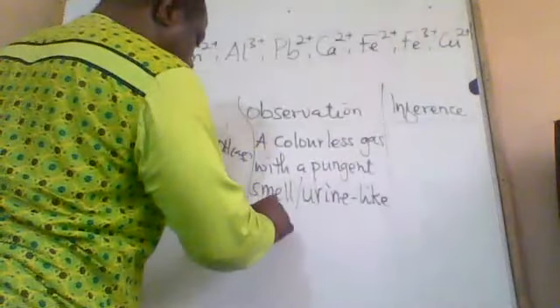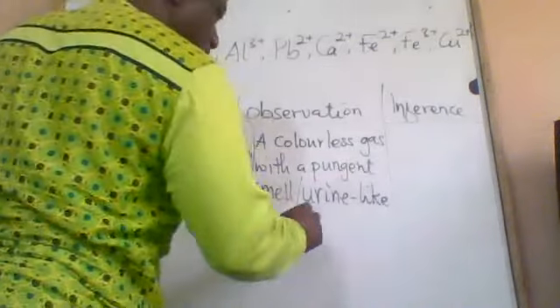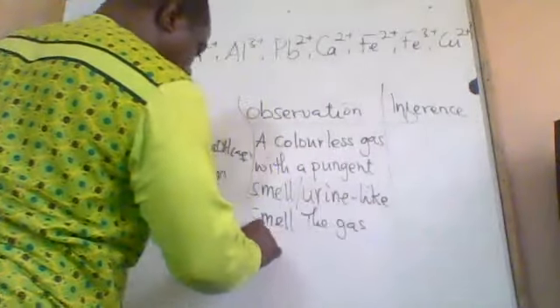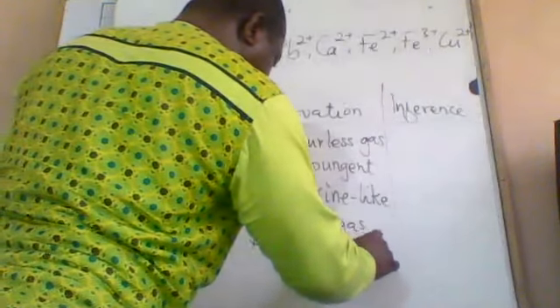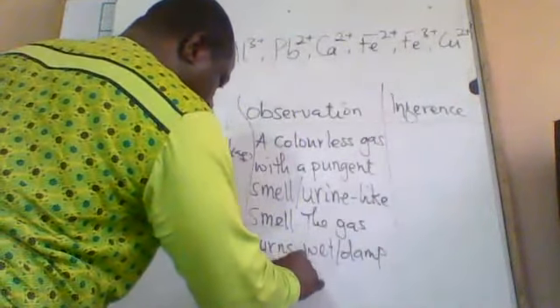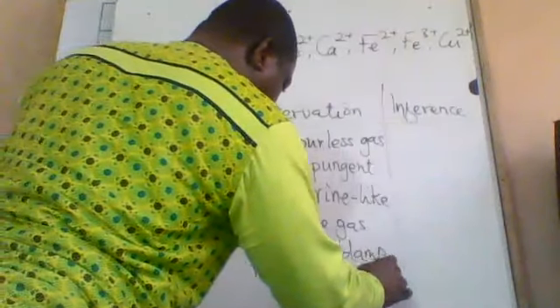Urine-like smell. The gas turns wet, or if you like, I use the word damp, damp red litmus blue.